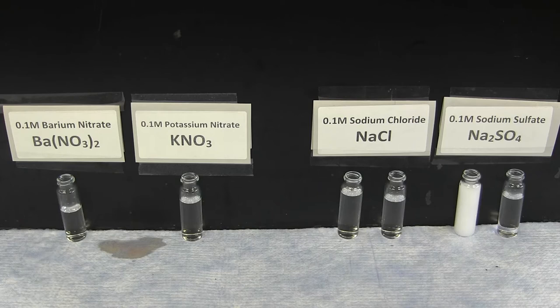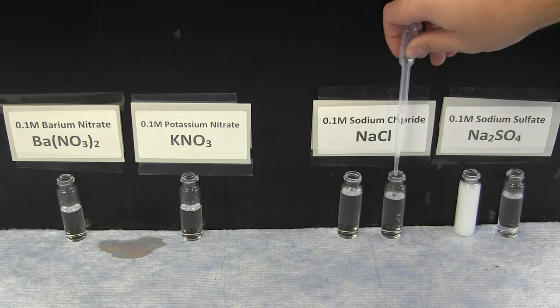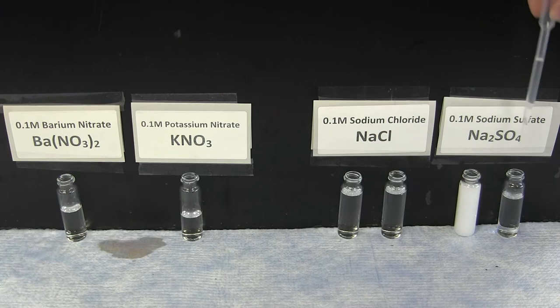The same thing can be seen if you change the cation by changing it from barium to potassium. There's again no reaction with the sodium chloride, but now there's also no reaction with the sodium sulfate. By switching out the different cation, there are different reactions.